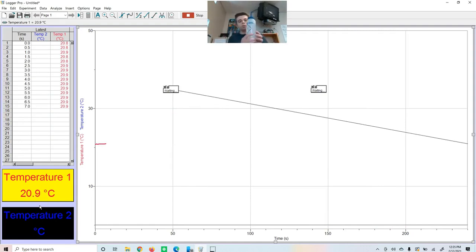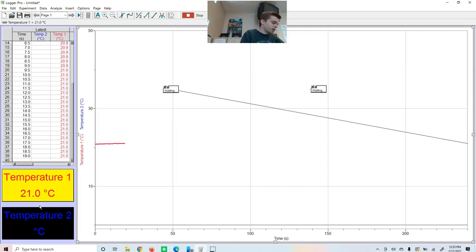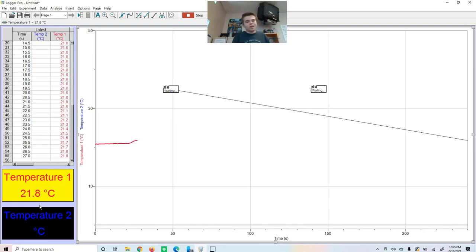And we're just going to put this wonderful distilled water on it. This is as close to pure water as we can get in this school, and really anywhere. It's hard to get water without impurity. So we've let it sit for about 15 seconds. I'm going to go ahead and soak my paper towel with lots of good water, and we're going to let it run for a good solid time.